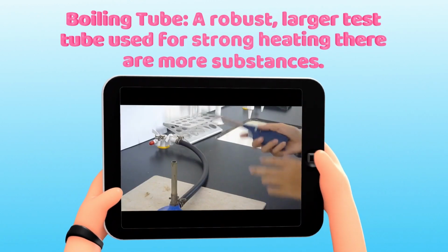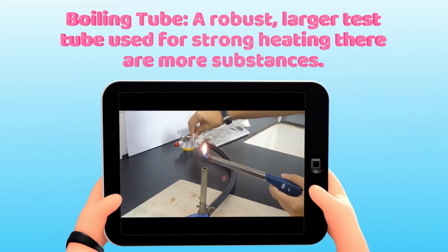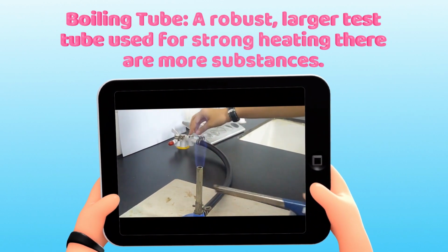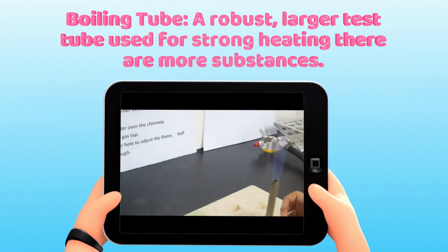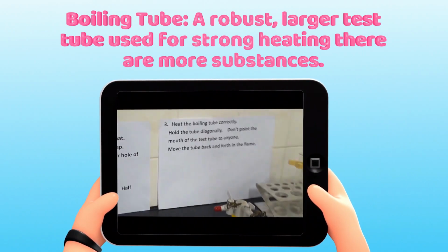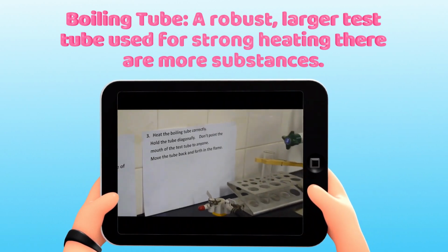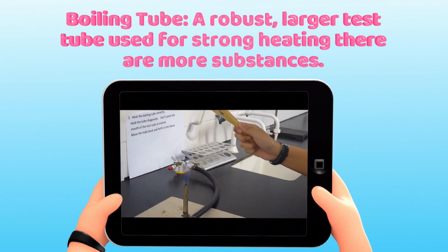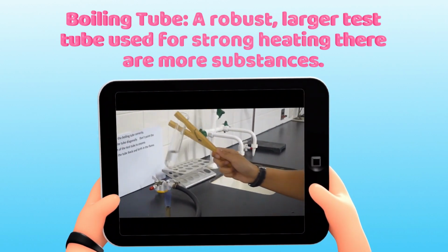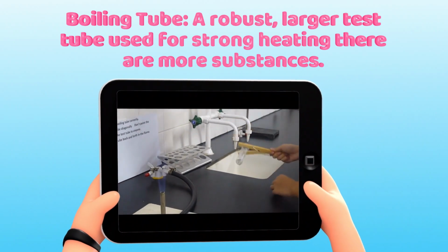Another apparatus is the boiling tube. This is a robust, large test tube used for strong heating when there are more substances to heat. As you can see from the screen, that is what we call a boiling tube. It is used for boiling purposes.